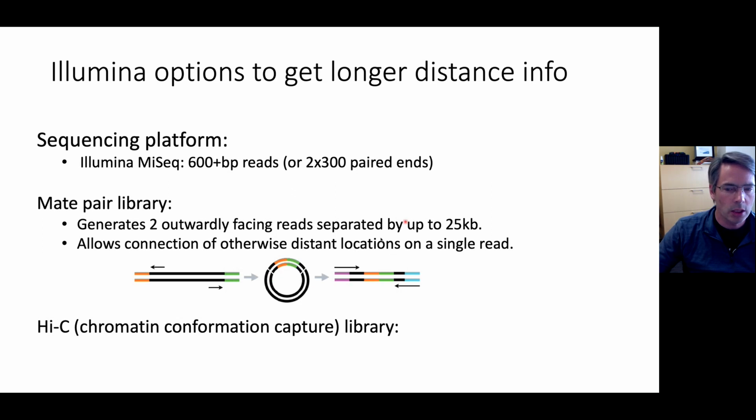So just one way to use the Illumina short read sequencing to get location information or distance information beyond what you could do with the standard library prep.